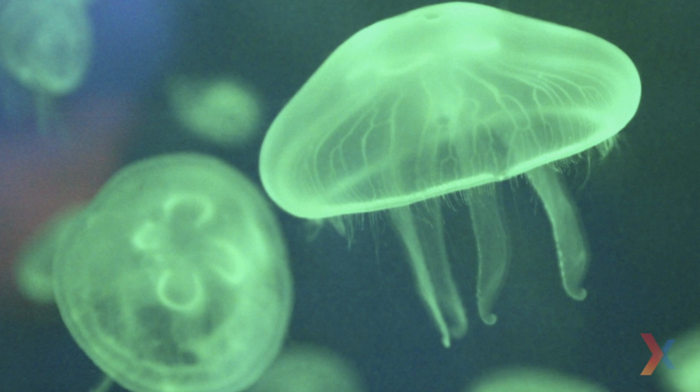Today I'm going to be talking to you a bit about fluorescence microscopy. Now, before we get into the nuts and bolts of fluorescence microscopy itself, I want to first go over what fluorescence is. Many of you may already be familiar with the concept of fluorescence. The most simple example of fluorescence would be the way a jellyfish glows a fluorescent green.